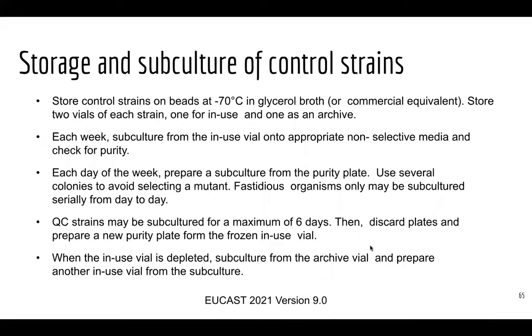And I've talked about storage before, but you can subculture your strains as well. One of the ways that you might keep bacteria is not just by storing in the freezer, but by subculturing. So it's always good to have a -70 or -20 strain in beads of your bacteria kept in glycerol, so you've always got a backup.